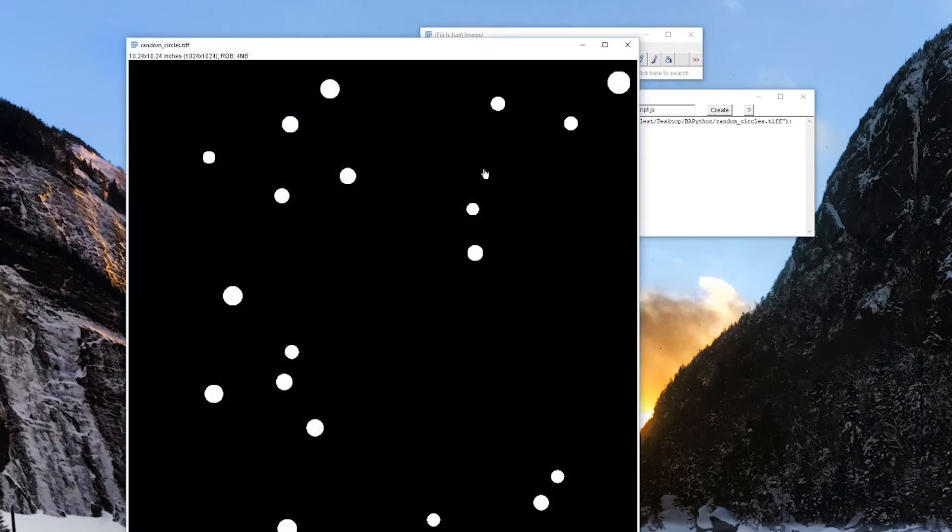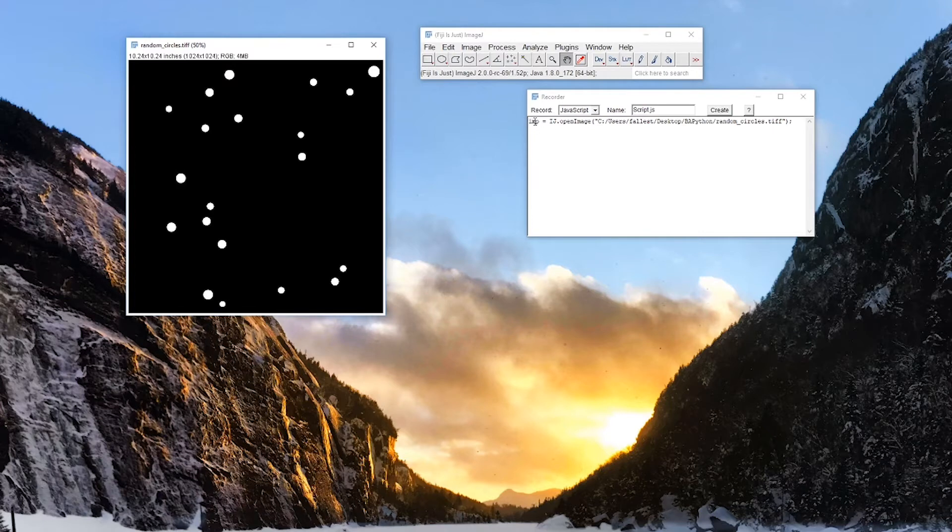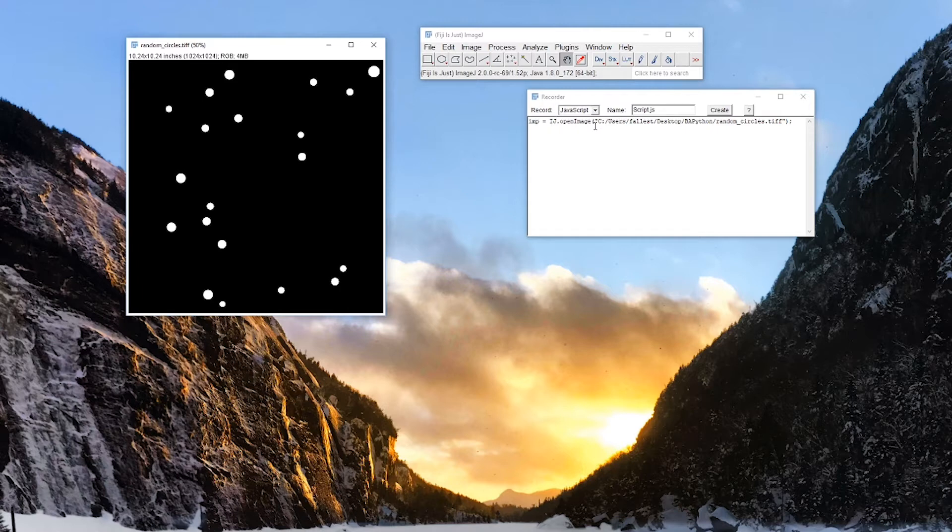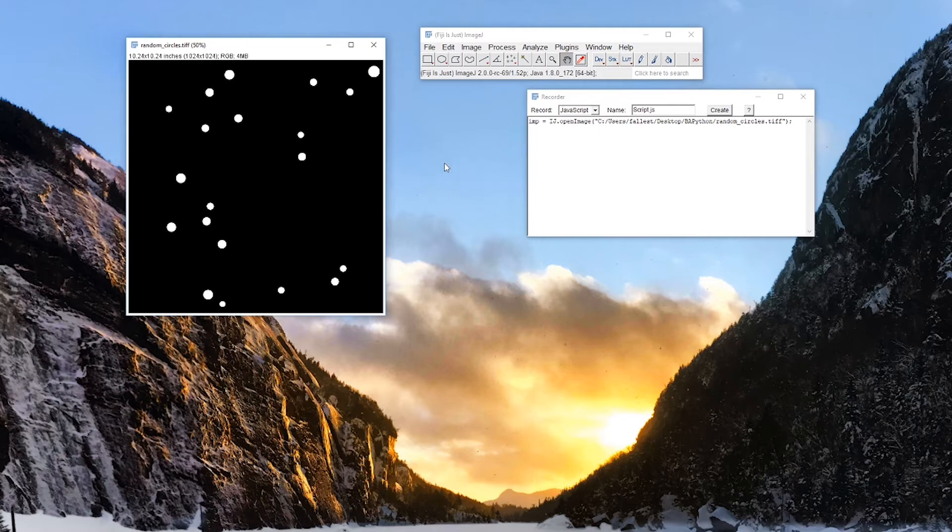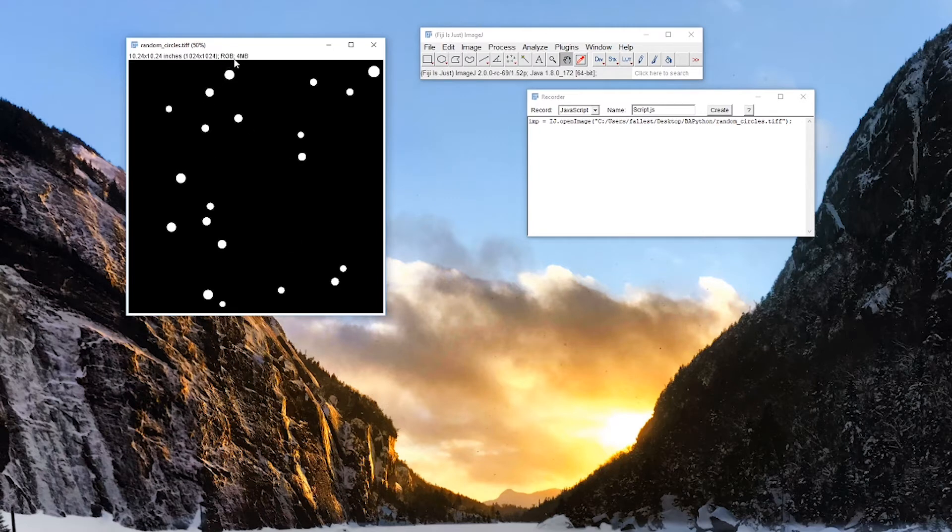Make that a little bit smaller. You can see imp, which is what we call an image in Fiji, is IJ for imagej.openimage, and then this is just the path to the image. We'll work on that a little bit more. So we have this image. It's RGB.